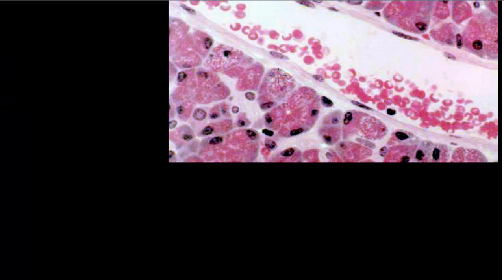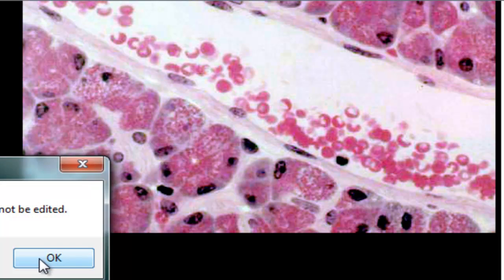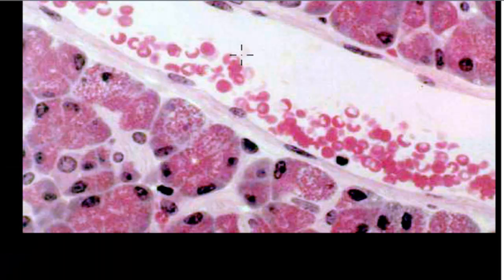All right. Let's look at another one over here. So, what you're looking at here up on the right-hand side of the screen is technically an endothelium. It's a capillary. Here are some red blood cells. And the epithelium is right down here. So, on a lab exam, I might have a pointer on here. Or on a lecture exam, you might see just an arrow drawn on an image pointing to the epithelial cells. But look at this nucleus right here. See now that nucleus is squashed flat.